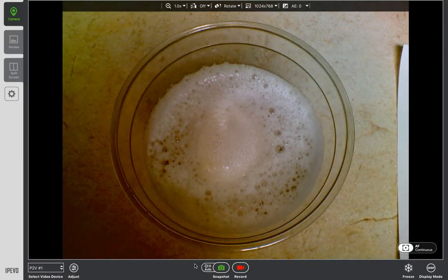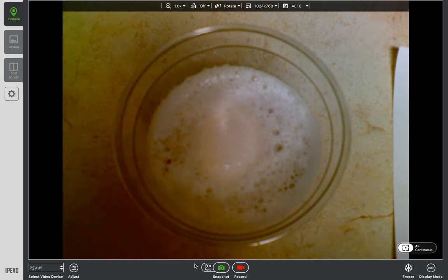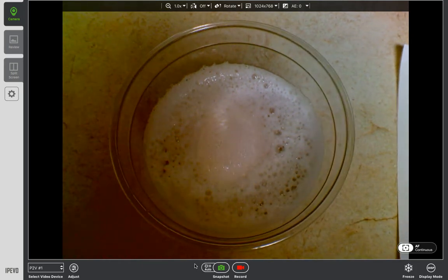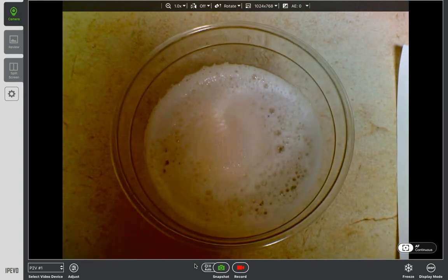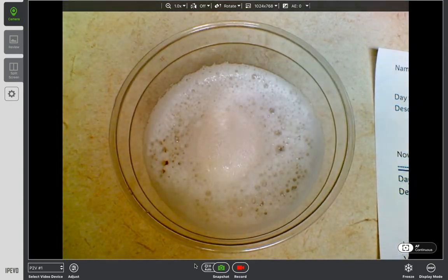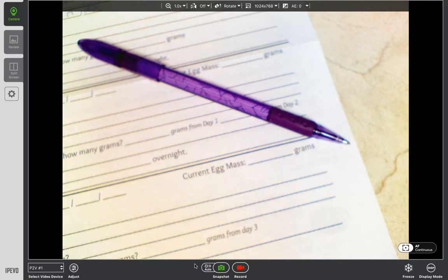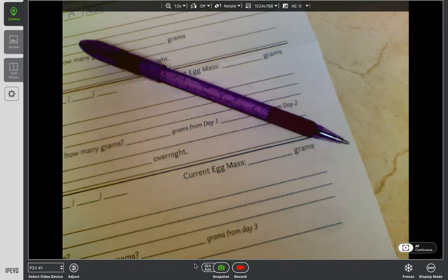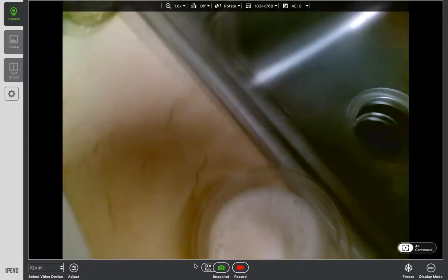So that's the shell that we're seeing on the top, or the shell has been kind of dissolved away by that acid. So some things we can do is we're going to look at this, and first and foremost, you want to be careful with your egg. We're going to dump this out, but your egg is somewhat fragile. When we take this out, just be gentle.